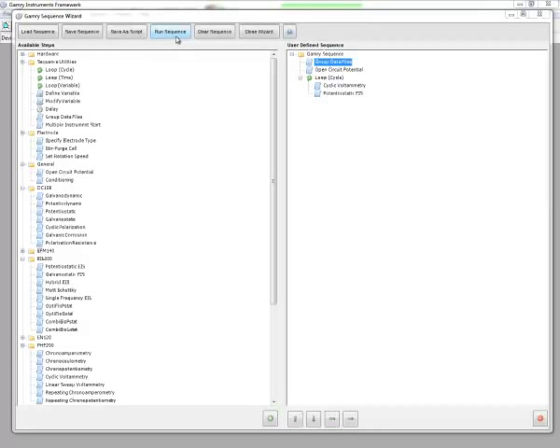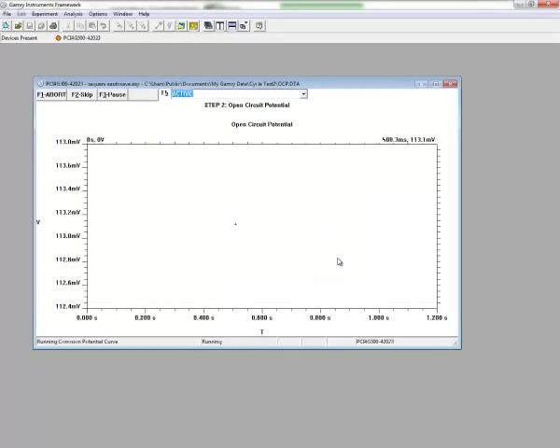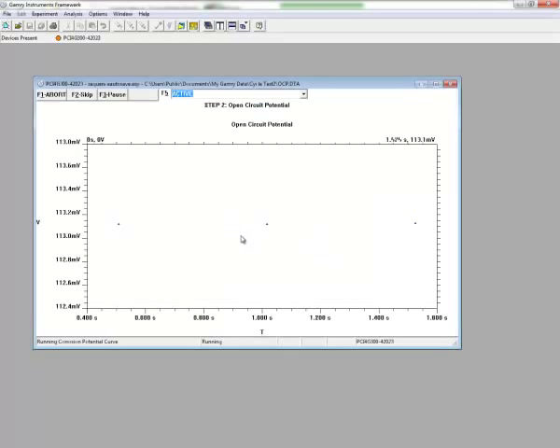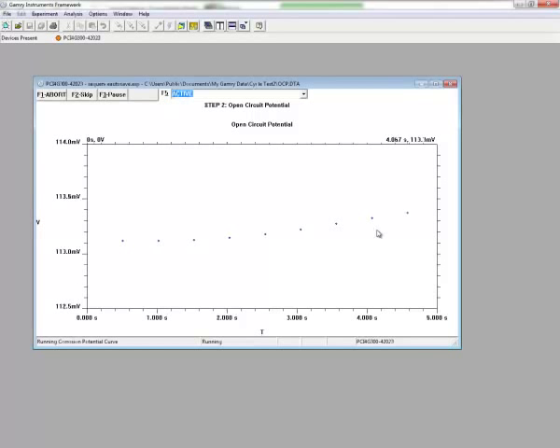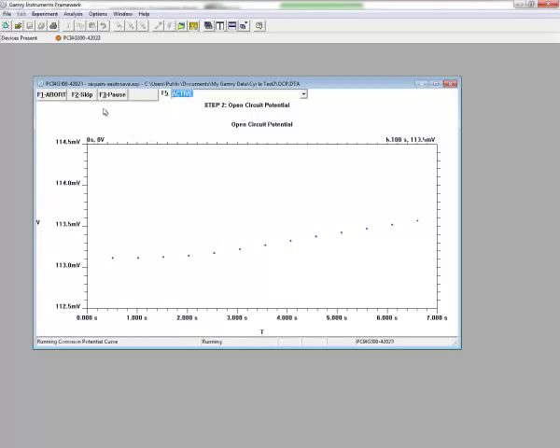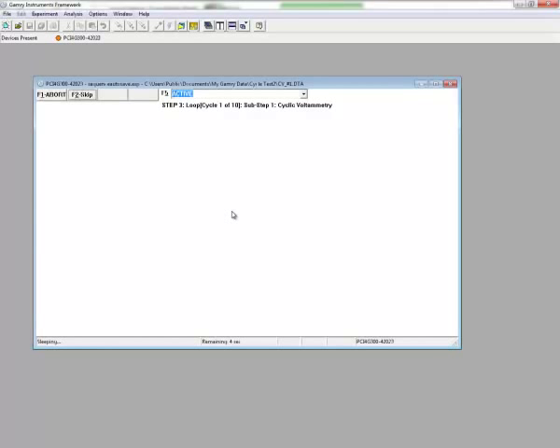And so now when I click Run Sequence, we're going to run the series of steps that are outlined. And we can see that the software has automatically selected the first available potentiostat. We click OK, and the experiment starts running. So first it was going to run the open circuit. And just to move things along, I'm going to click Skip so that we can move into the loop itself.